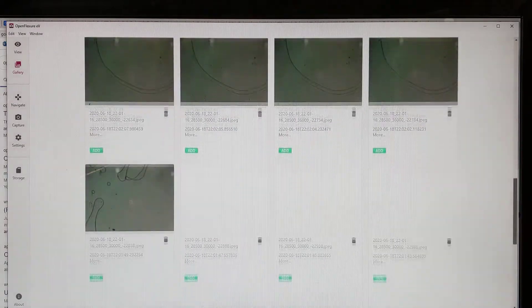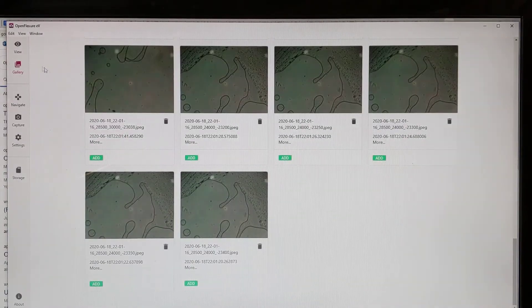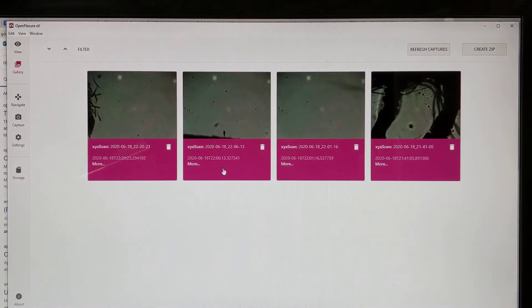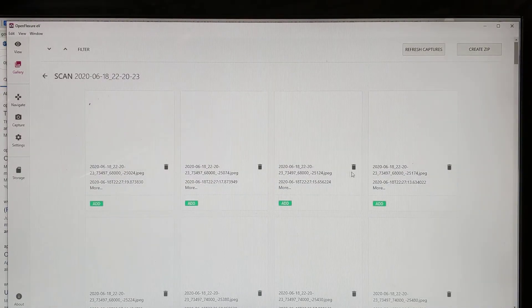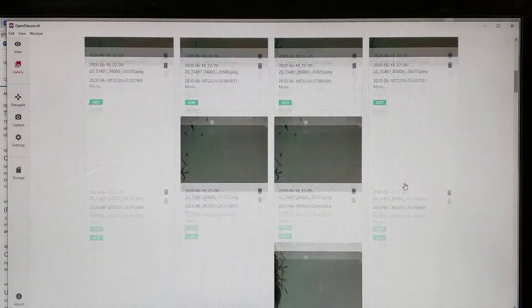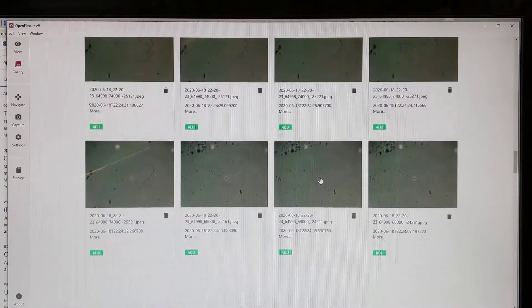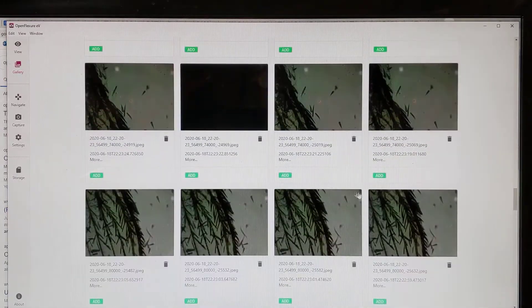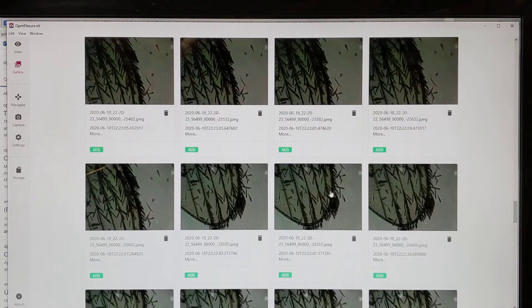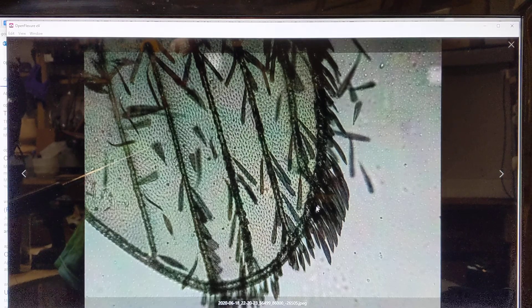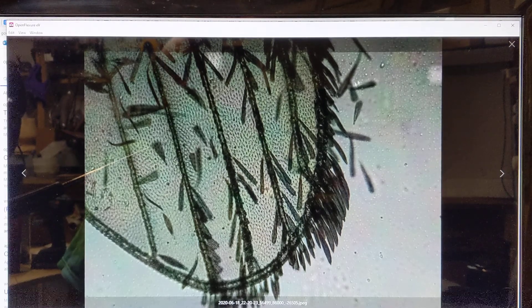I had a better scan here. Now you see these little speckles here — these are actually part of the wing structure. And here you see more of the wing structure; this is the wing of a mosquito. If you know how big a mosquito is, you can gauge the magnification by how large this tip of a wing is showing up. And these are what I was calling mosquito feathers.